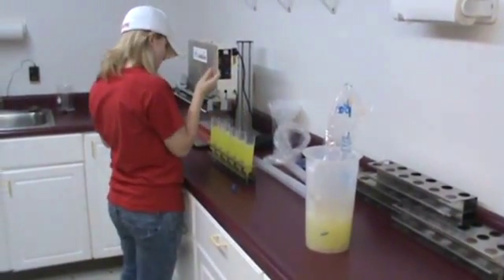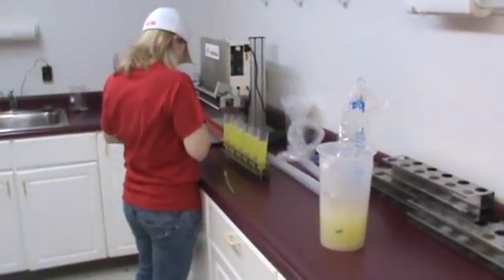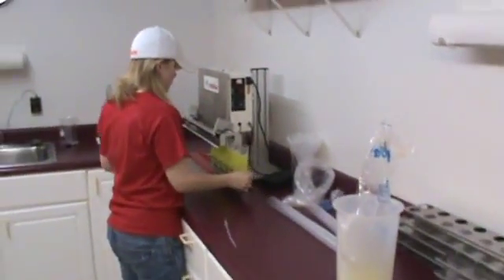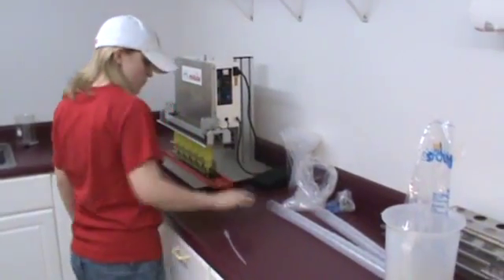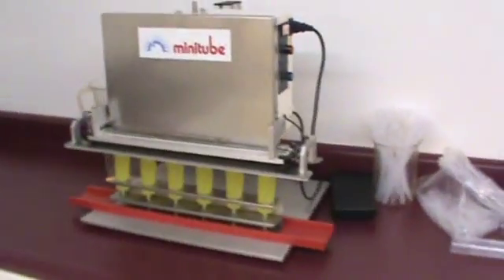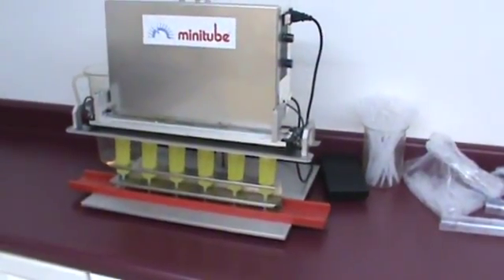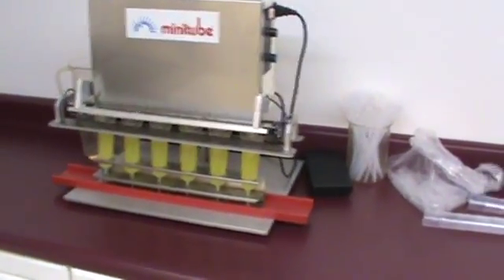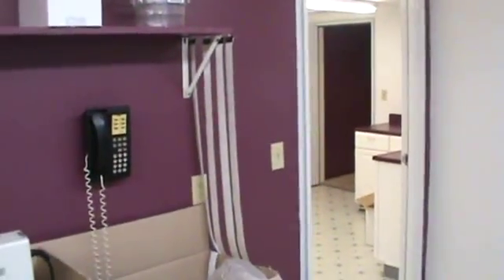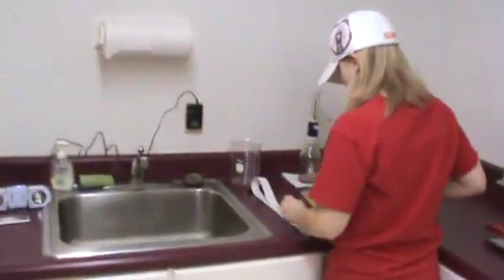You see her now taking a sample of that semen. We keep semen samples back from every collection, so that way if you have any questions on any of the semen that you receive, we can always look at those samples — normally at day three and day five post-collection. Those sample tubes just went into the tube sealer. As you can see, they're all lined up there. It'll take about 12 seconds — there we go, it just popped out. So Marissa comes over here and we pre-print all of our labels. She will take the labels and apply them to the semen tubes.